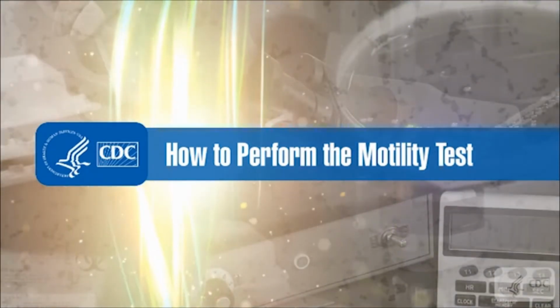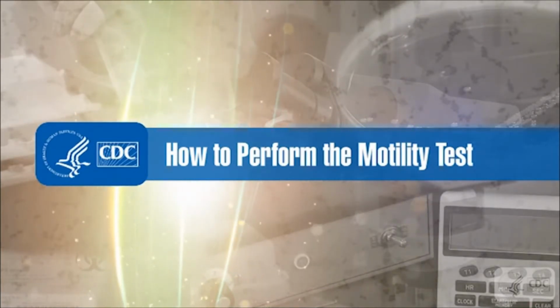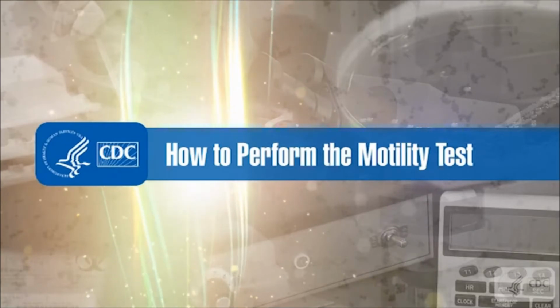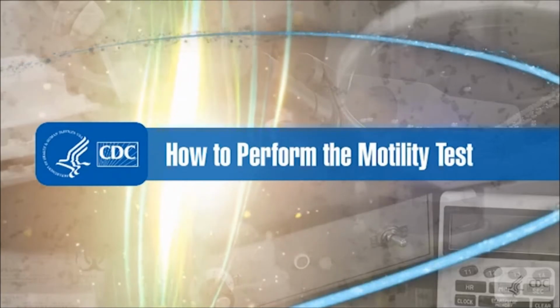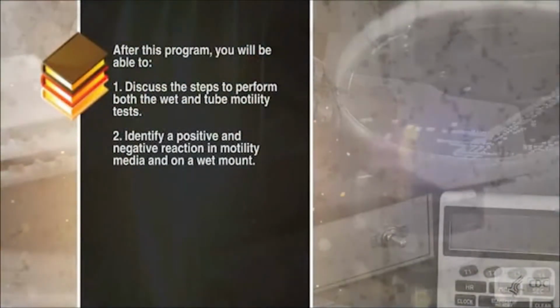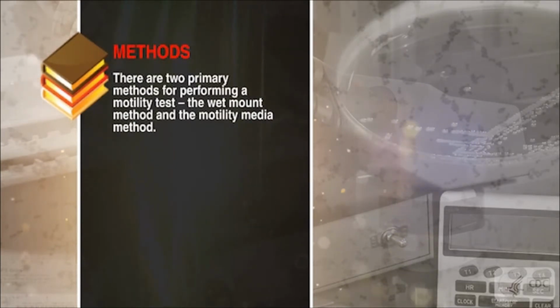In this short video, you will learn how to perform the motility test. This test is a useful tool to differentiate bacteria by detecting if a bacteria is motile due to the presence of flagella. After this program, you'll be able to discuss the steps to perform both the wet mount and tube motility tests and identify a positive and negative reaction in motility media and on a wet mount. There are two primary methods for performing a motility test: the wet mount method and the motility media method.